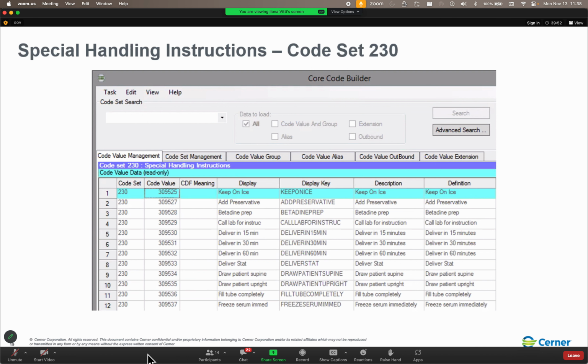Because the way that it used to be was that the physician would place an order with an add-on collection priority. The lab would try to use the accession add-on mode of accession result entry to go ahead and add that order onto an accession number. And then they would go back and they would cancel the order that was actually placed by the physician if they were able to successfully place a new add-on order on an accession number in the accession add-on mode in department order entry. Now, with this add-on priority, we don't have that problem anymore.